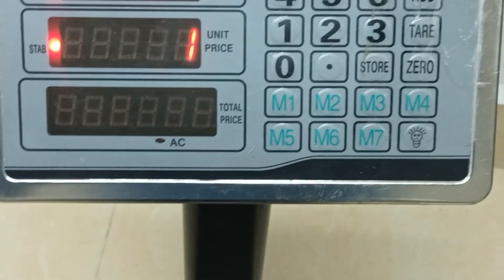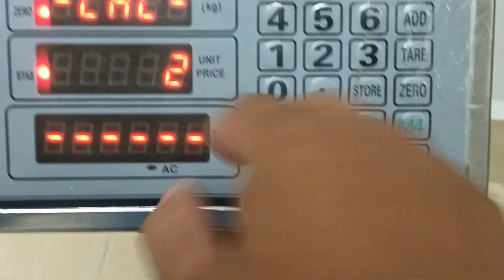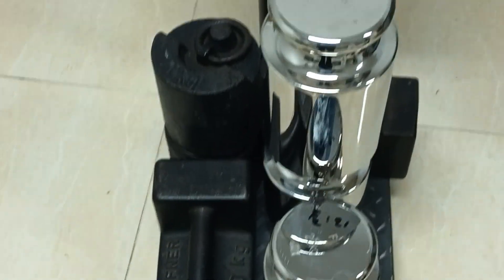I will choose to put the number one and press here, and wait. And so I will choose Adja for 100 kg — this one.